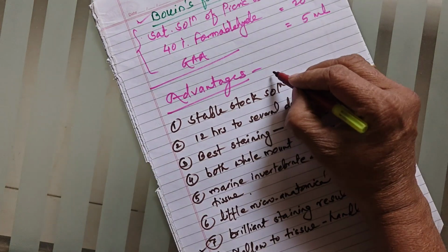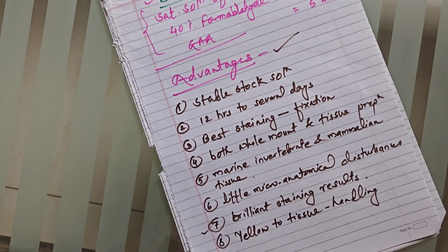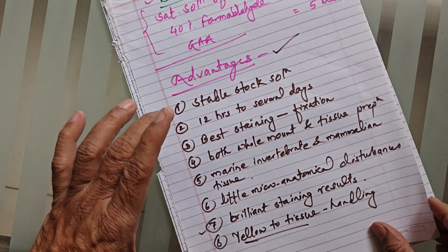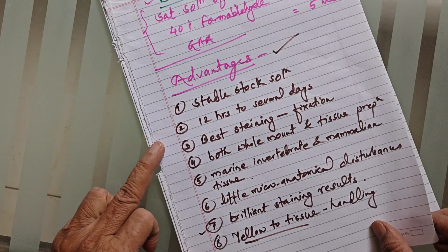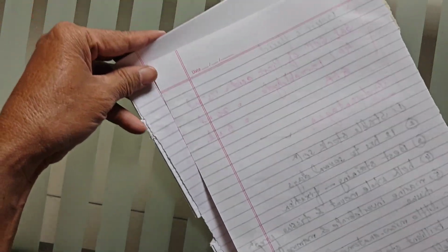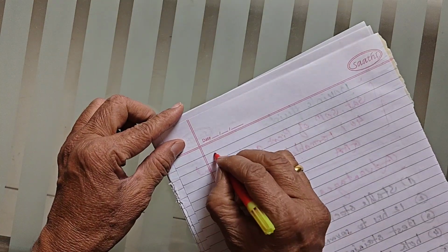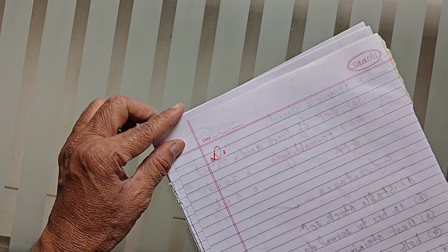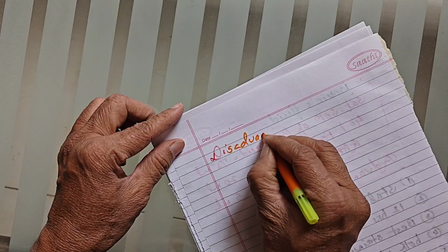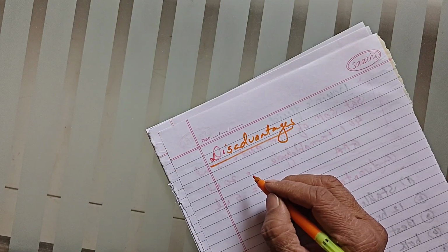So these are the advantages of Bouin's fluid. Yes, yellow color to the tissue. Though it has these advantages, on the contrary, it has a few disadvantages. Let us focus on the disadvantages of Bouin's fluid.